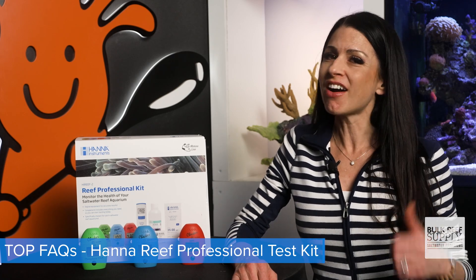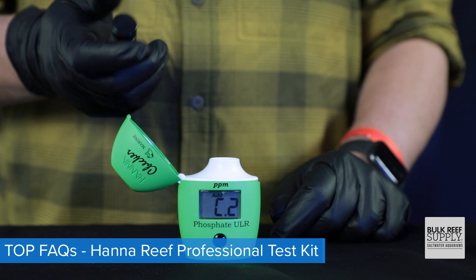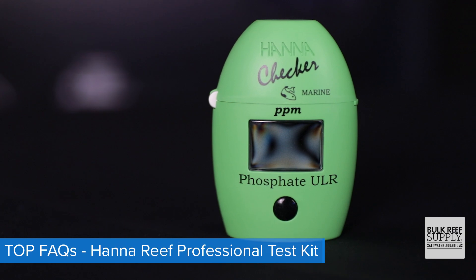Today, answers to your top five questions on Hanna's most popular checkers, all included in the Pro Read Kit. Are Hanna checkers really that awesome? How do Hanna checkers actually work? How to use them? How to read them? And why is the ultra-low-range phosphate checker the most popular phosphate checker choice?